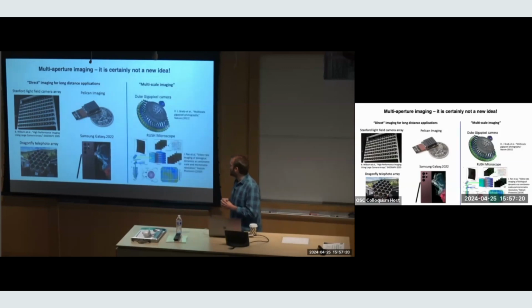And then there's multi-scale imaging. So Dr. Brady here is a pioneer in this field, and you can have many cameras in an array that image or capture light from an intermediate plane. And here it's imaging an intermediate plane.